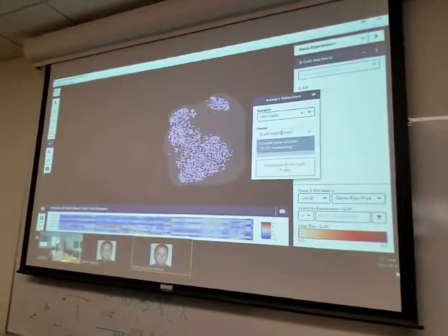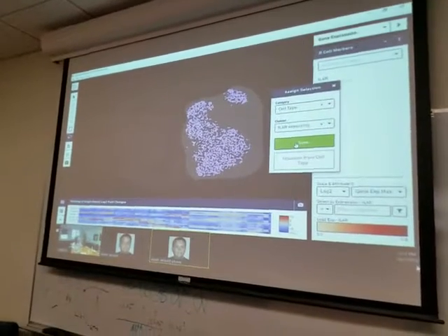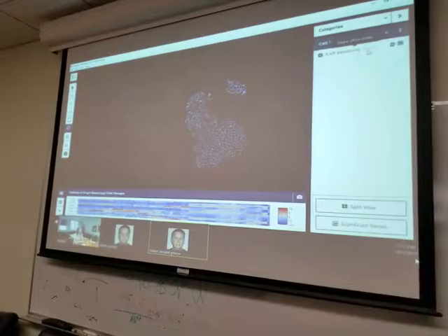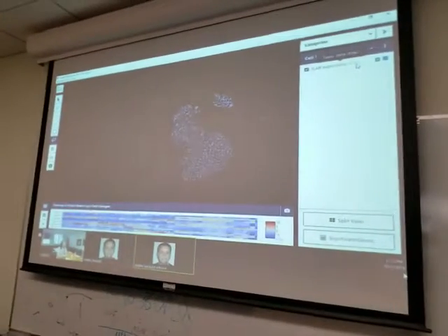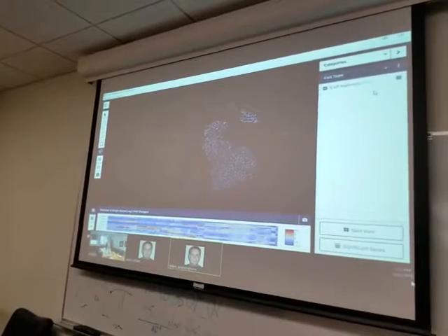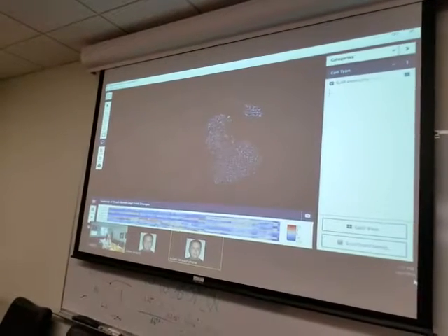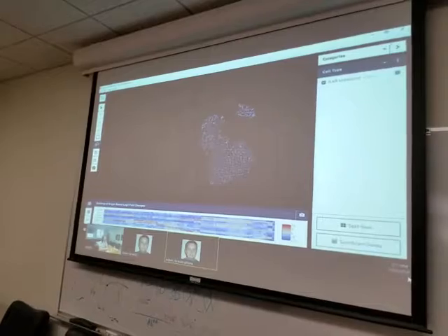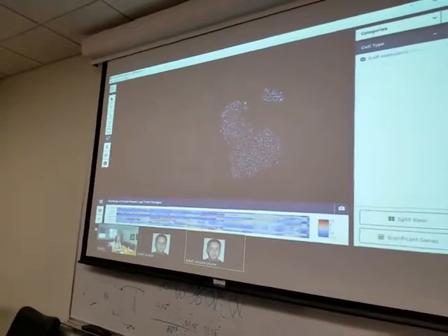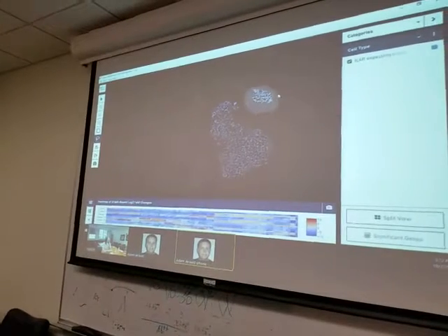This is arbitrary, whatever. And so now what I'm left with is I can see I've got 2,816 cells out of, I think this data set has 8,000 in it, that I've specifically lassoed. But I can go a step further and subdivide this.